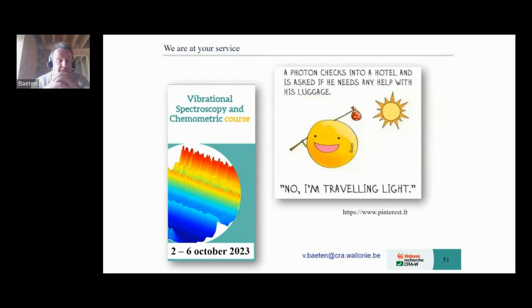The second point is to have good models. If you want to determine, let's say, the protein content from cereals, you should have a very good model that allows you to take the absorbances that you get, for instance, in near-infrared, and to make a correlation, to make a prediction of the protein content. And so the mathematical models are also very important.